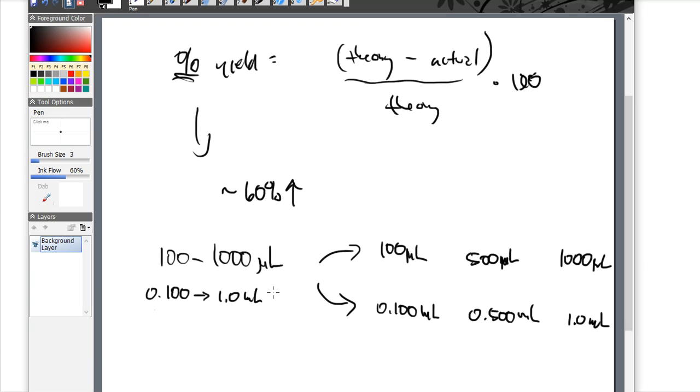That micropipettor is appropriate for that amount. Okay, so in the beginning of this lab procedure, they're telling me to take 1.1 mLs of water. Whatever, we're not doing that. We're going to take 1 mL of water.